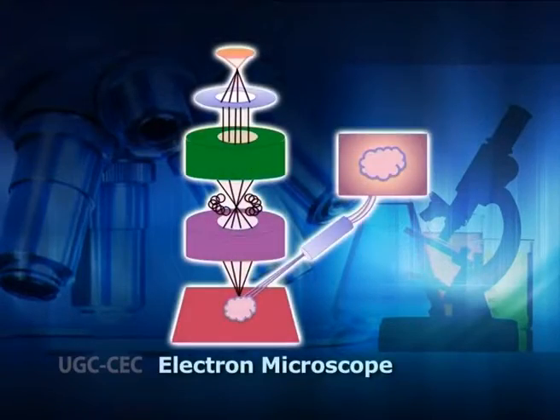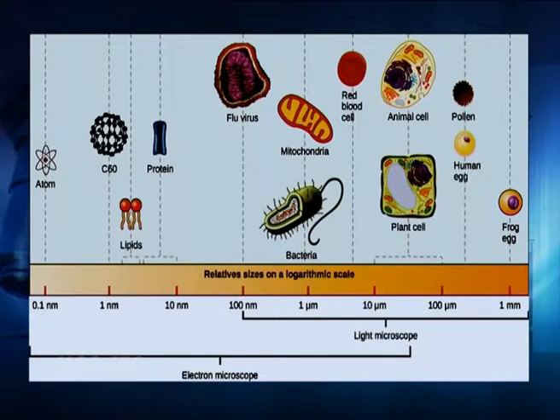This microscope is powered by a beam of electrons with very short wavelengths. These electrons strike objects that come into their path and increase the resolution of the microscope. The electron microscope is used to study cells like tiny viral cells as well as large molecules. There are different types of electron microscopes. Let us collect a brief idea.